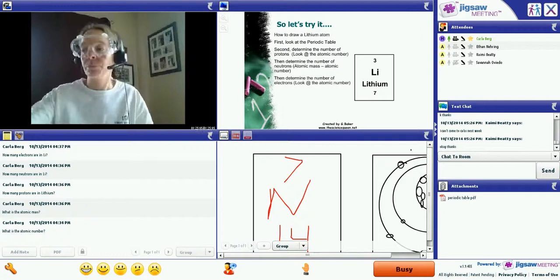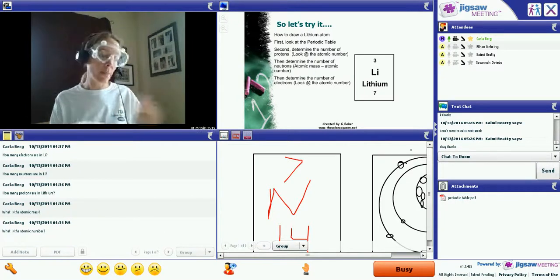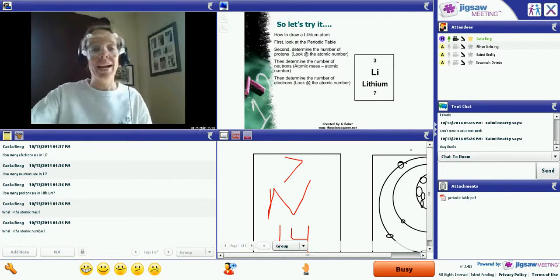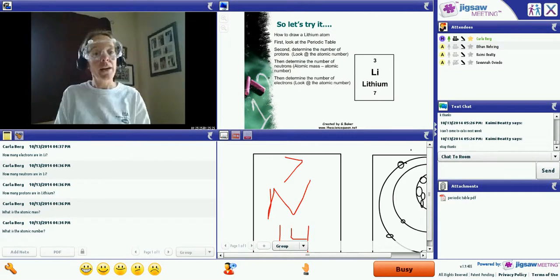Okay, when you're cleaning up today's lab, make sure that you clean your well plates out soon so that the precipitate does not stay in the bottom of the well plates. You will need to keep your well plate. You will need to rinse your plastic toothpicks because you will use those again during class. Okay, anyone have any questions? All right, so we will start next week out with your presentations. If you did not turn your lab report in, make sure that I get it at some point today.